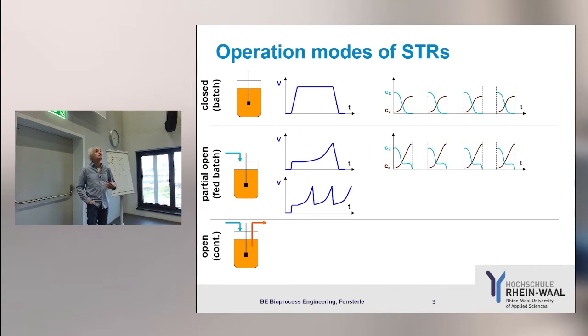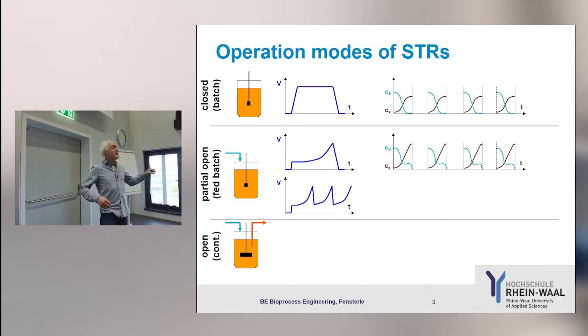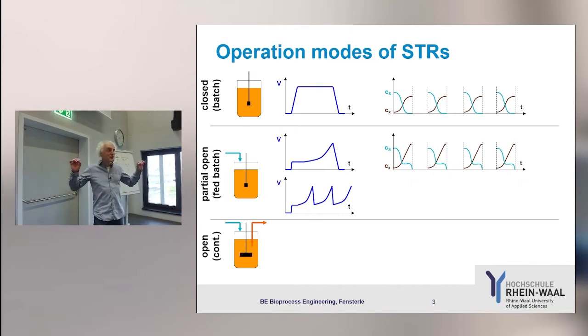But you don't need to do that. This is also important in the lab course: if we have a chemostat running and we don't adjust our pumps correctly, you could also end up with an empty reactor the next day or with a completely full reactor the next day. Because the reactor doesn't know what you plan to do.